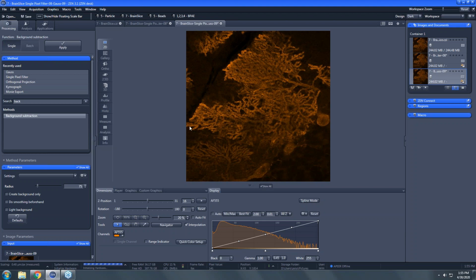So objects have high contrast, background is generally more homogeneous. The way that we find homogeneous regions versus high contrast is we move around and look at very small regions of the image by setting the radius. The radius parameter determines the size of the region of the image that we're looking at. If we look at that small region and we have homogeneity, then we can say, oh, this is background, and we can subtract it out.